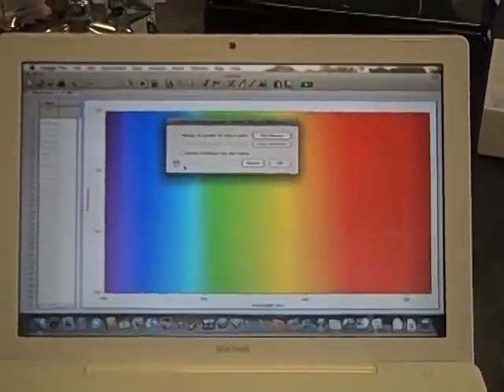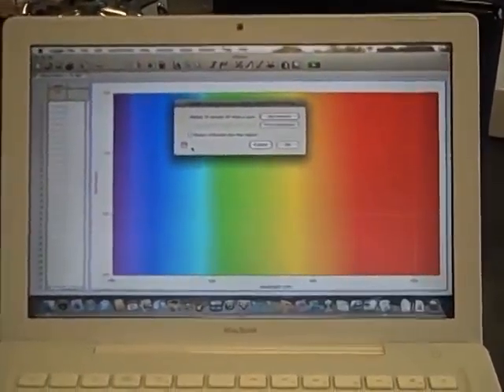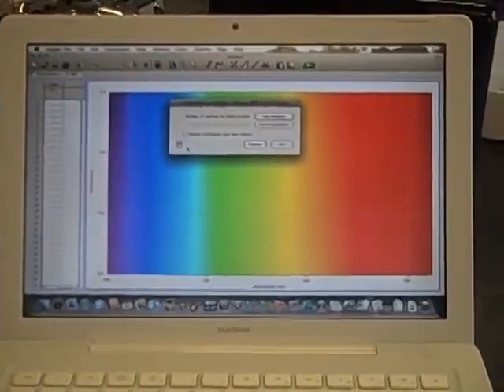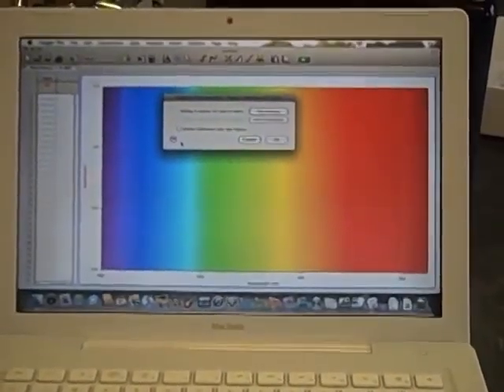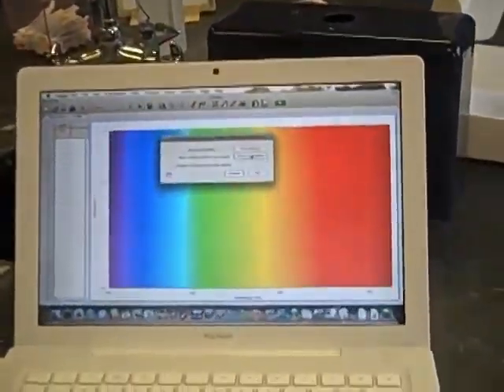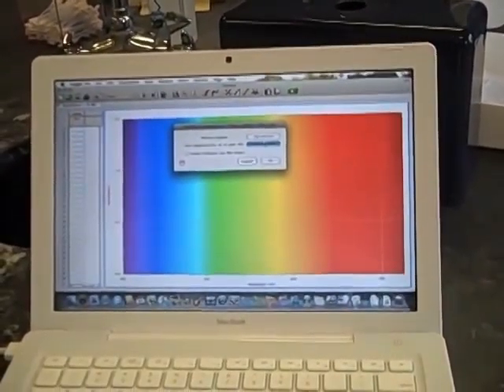A couple more questions on this. So you're not only going to be determining the equilibrium constants for these different trials, but you're also going to be able to figure out an unknown concentration, aren't you? Yeah, based on what we find with our given concentrations, we can use unknowns and figure out their absorptions with the spectrometer, which then we can find their unknown concentrations. So that's really great. Thank you. So now the warm-up's done. And now it's calibrating, which is pretty fast.